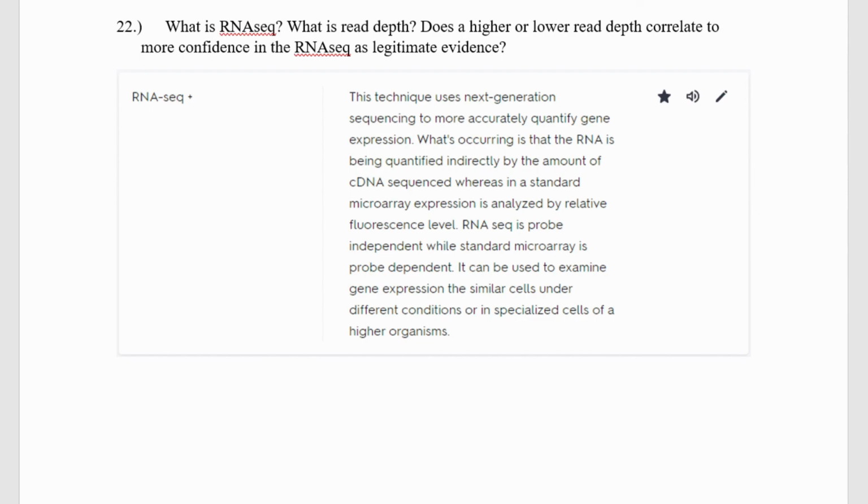Some genes you need to be constantly expressed. Examples of genes like this are maybe genes that encode histone proteins. You always need histone proteins. Or you need ribosomal proteins. You always need ribosomes. So genes that encode these are much more active. And you can actually see how active a gene is in being expressed by the amount of RNA that is transcribed from it. So what RNA-seq does is it takes the RNA, turns it into cDNA by reverse transcriptase, and this I talked a bit about in the first worksheet if you want to refresh on that. And then this cDNA can be analyzed and quantified.